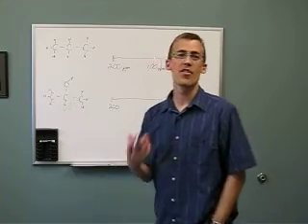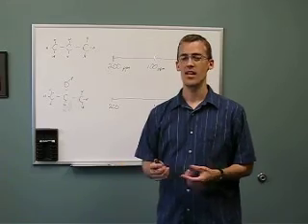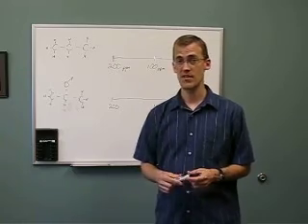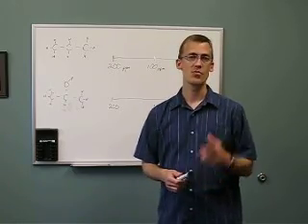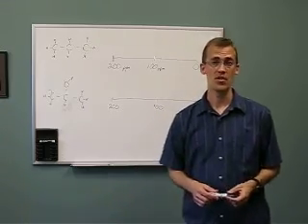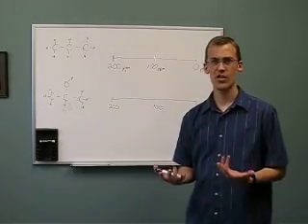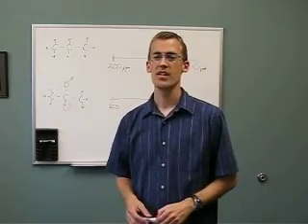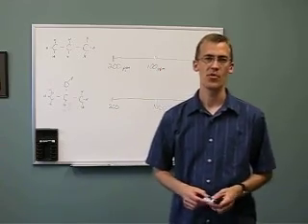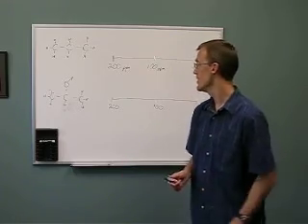So we're going to be looking at carbon-13 NMR, and most of the carbon atoms have 6 protons, 6 neutrons. They have an atomic mass of 12. These carbons we're not going to see because they have an even number. But carbon-13s show up well in an NMR, and so those are the ones we're going to look at. So we'll talk as if we're looking at carbons, but really we're only seeing that fraction of the molecules that have carbon-13 in them. It happens naturally and somewhat randomly distributed, so we get a good picture of the molecule.